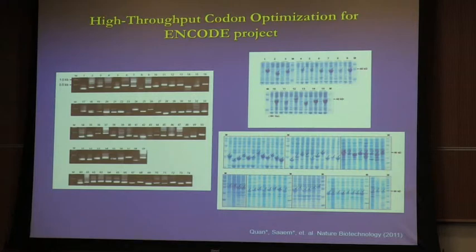And this technology is also good for picking the intermediate levels. This has some usage in synthetic biology where people build synthetic networks where they want to regulate the expression of each component in it, right? Normally you have a promoter that drives a string of proteins, but how can you manipulate the relative expression of each protein using the same promoter? This is probably one approach that you can use. And for that, you probably don't want the highest expression for every one of them. You want intermediate levels. I think this approach can probably provide that kind of solution to that problem.